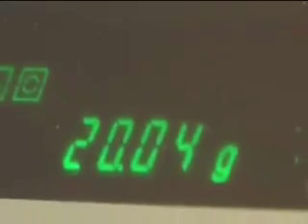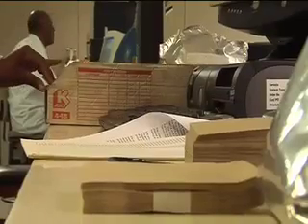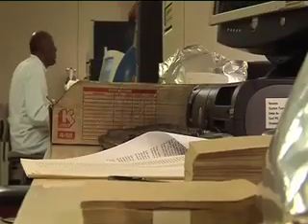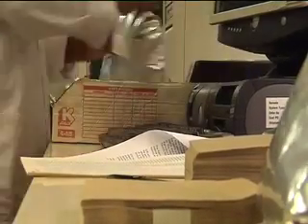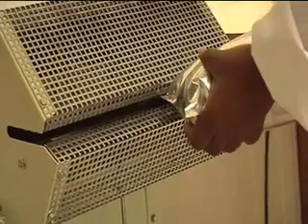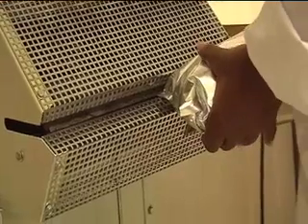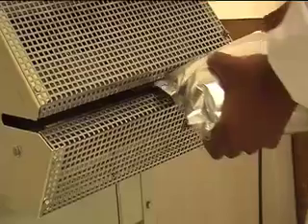The quantity of seeds removed should be recorded in the computer to update the seed stocks, as well as for the label on the new seed envelope. The seed samples are taken from the package and weighed, and then packed into small brown envelopes. The seed gene bank packages should be quickly sealed again to avoid the seeds absorbing humidity.